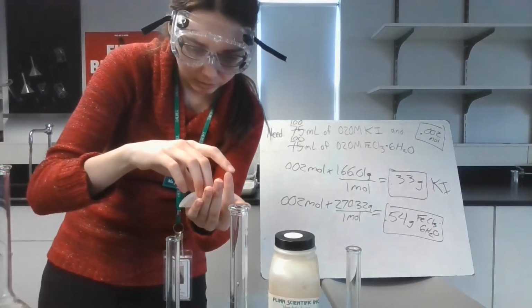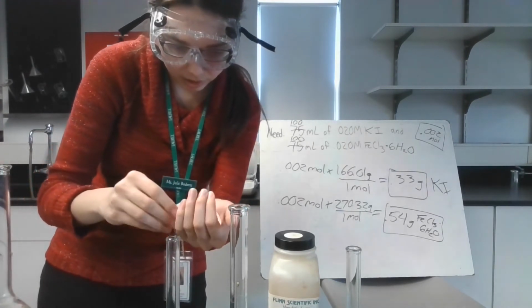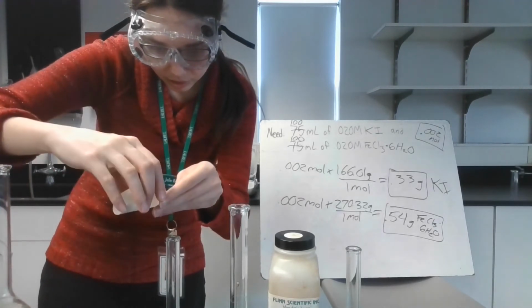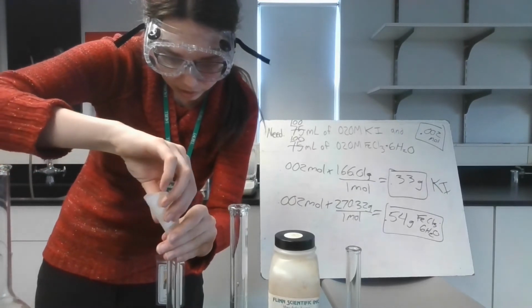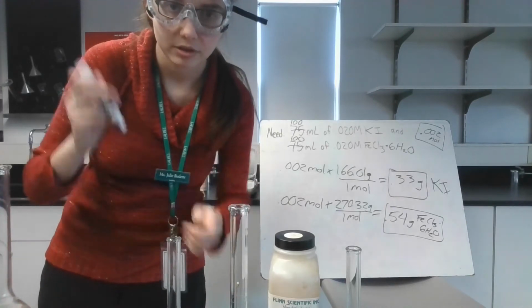Oh my gosh, 0.33 grams is not that much. Cool. Okay, so this is my KI here.